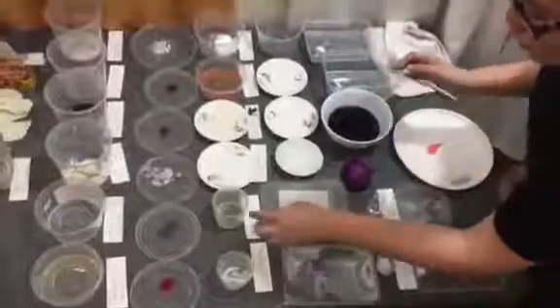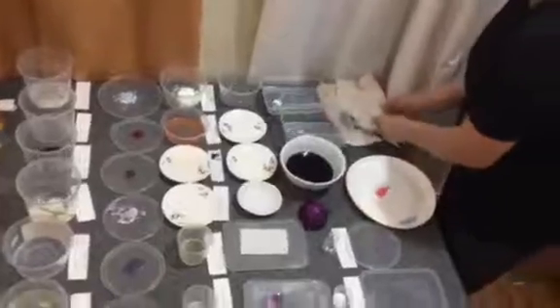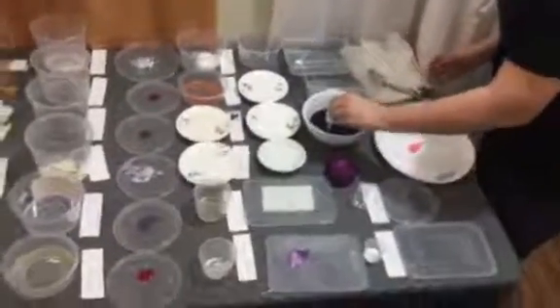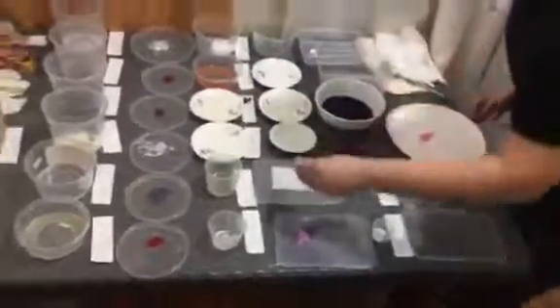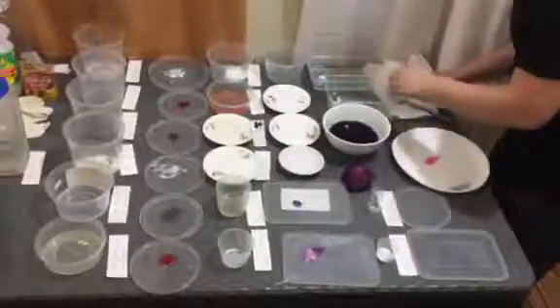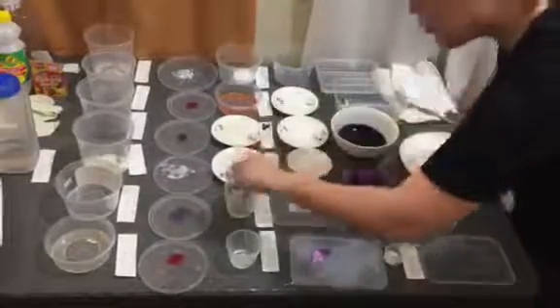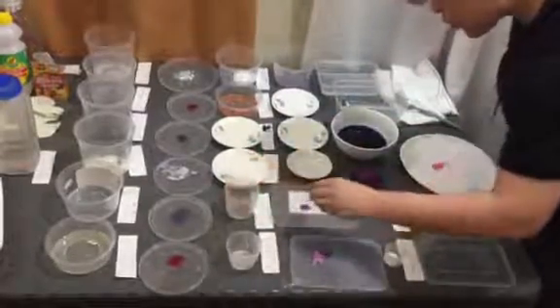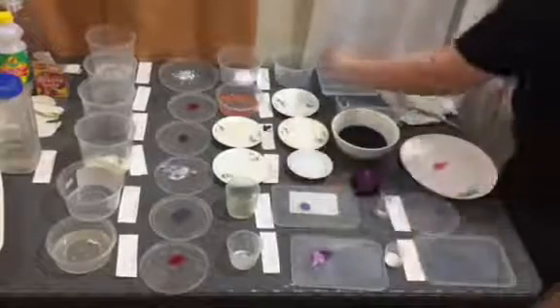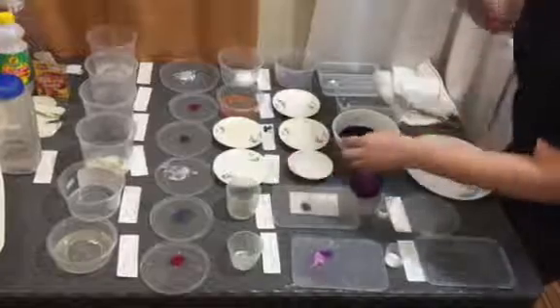Next, brown sugar in water. Next, salt in water.